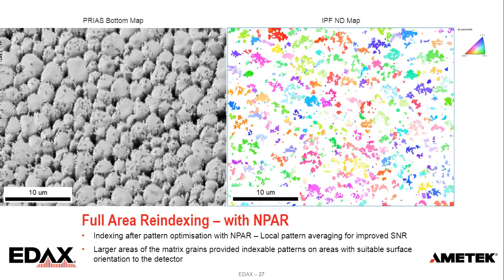And we start to get signal from the underlying grains as well as the brighter particles. And what that shows, and I'll show again if I go back and forth, is that I mentioned those platelets have an alignment with the grains. It's a preferred growth of those platelets off of the grains, or at least a similar orientation relationship.